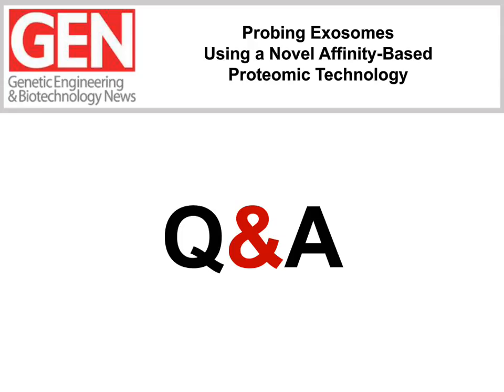It's very different, of course, from a mass spec approach, where you're in the extreme lytic denaturing kind of situation. And certainly we found reagents like DTT to be very important in helping us rip open exosomes and solubilize proteins properly. But they were just simply too harsh for the SomaLogic platform. So tinker with those reagents with some care, I think, if you're going to use this assay.